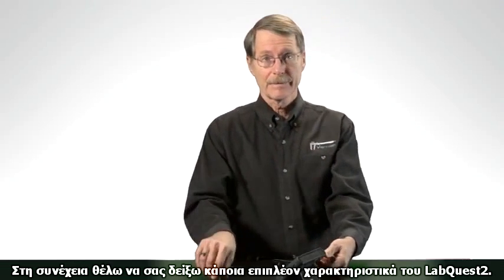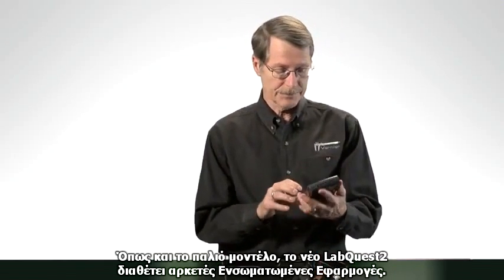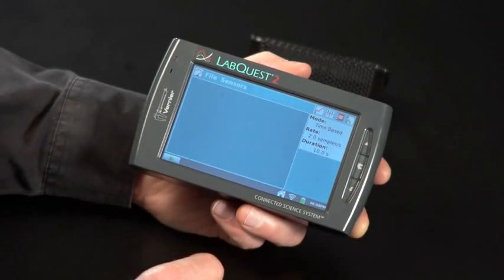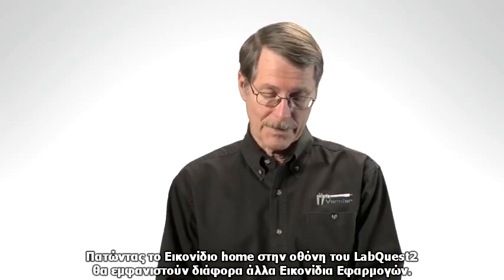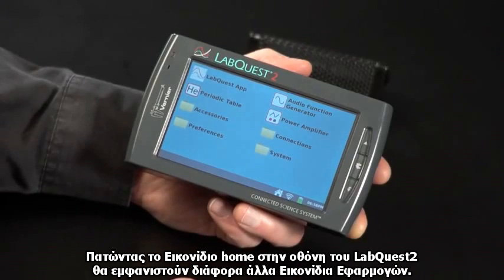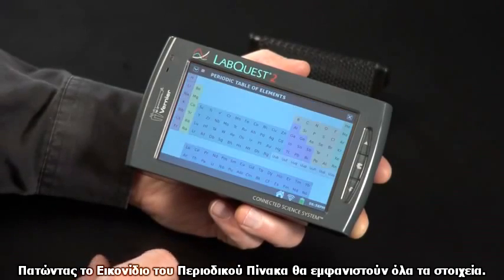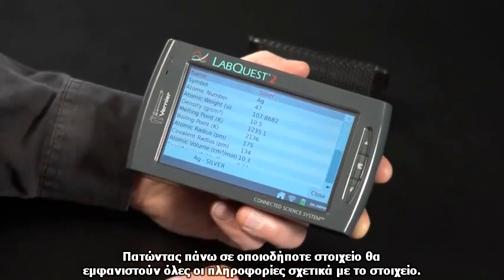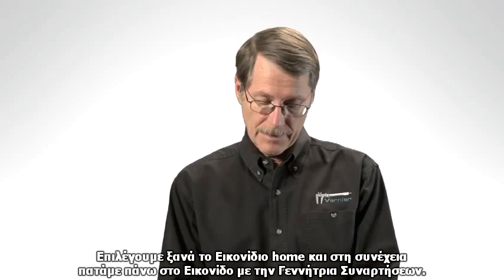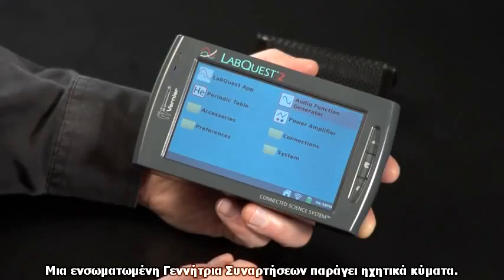Now I want to show you some other things about the LabQuest2. It comes with a number of built-in apps other than the LabQuest app, which we've been using for data collection. If I tap on this icon here for the home, you'll see several icons of other things to use. For example, there's a periodic table. If I look at this, you'll see I can tap on any element I want and get information about that element.